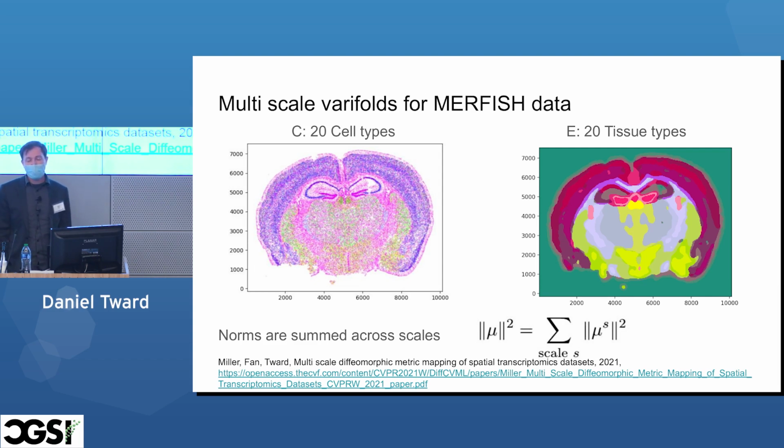And what you can see here is something that looks very similar to the annotated brain atlas that I showed on slide 2. So many of the brain regions that I described show up clearly as a tissue type here. Over here, you can see the hippocampus and some of its subfields. You can see the cortex in bright red, as well as some of its layers and parcellations. You can see a strong difference between the basal ganglia and the thalamus, for example. So we're really classifying brain compartments in this manner.